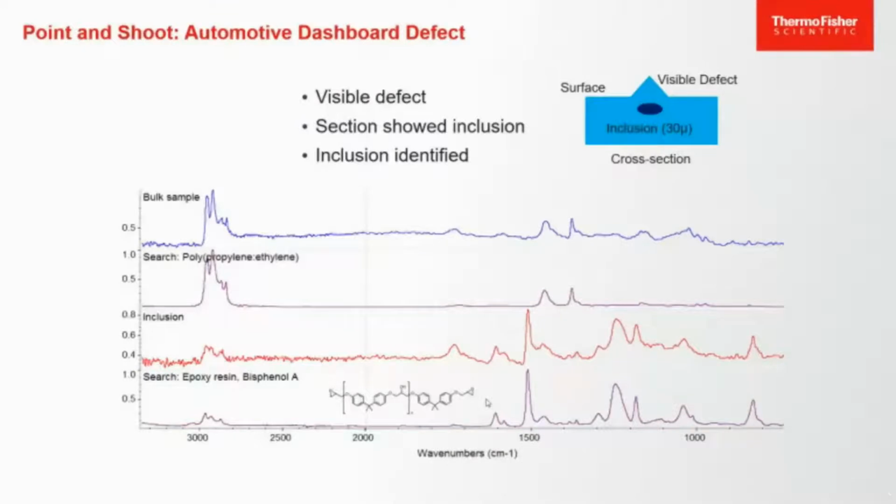This showed that some of the plasticizer had actually aggregated into a puddle or a bubble inside the sample as it was being formed. This caused this defect, and the presence of that bisphenol A stressed the local material, causing this pucker, causing the sample to erupt, if you understand, into this dimple. So that was an analysis where we were able to tell what caused this surface defect.